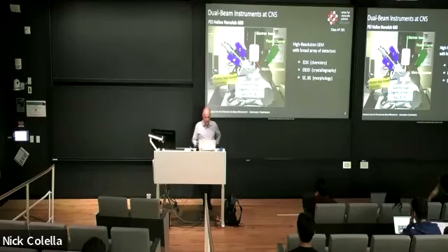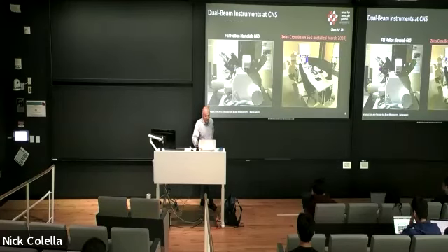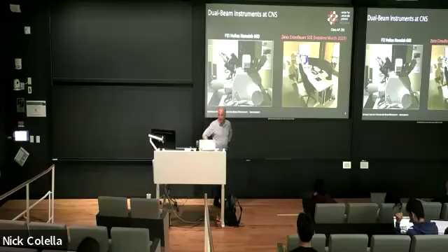So overall, it's an extremely powerful tool where we can analyze the sample and sculpt the sample with the ion beam.